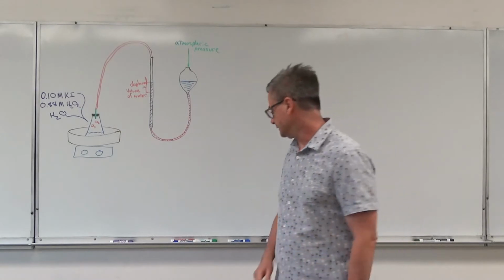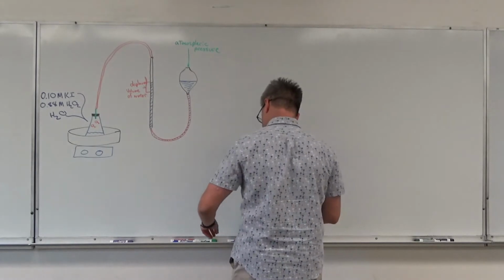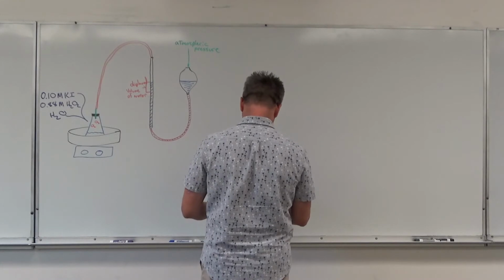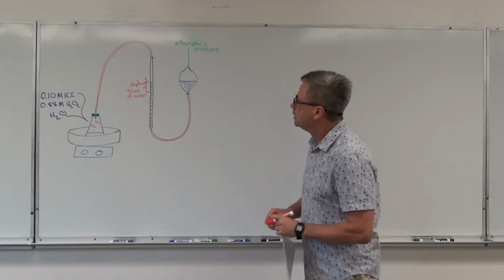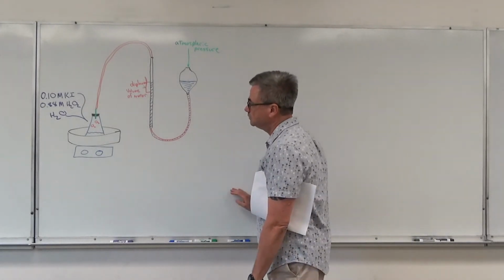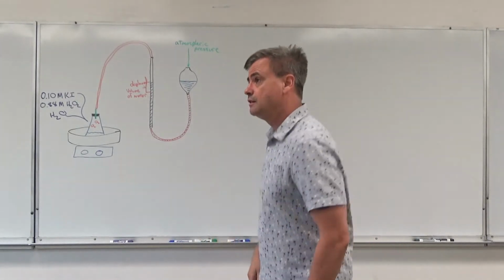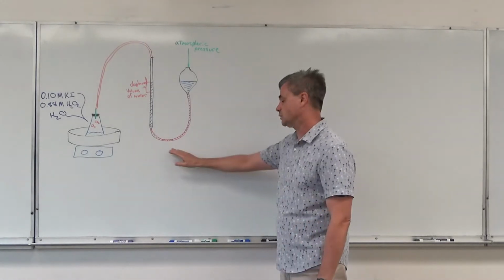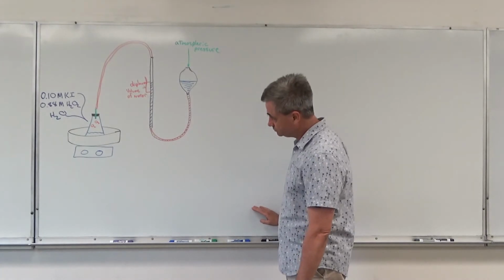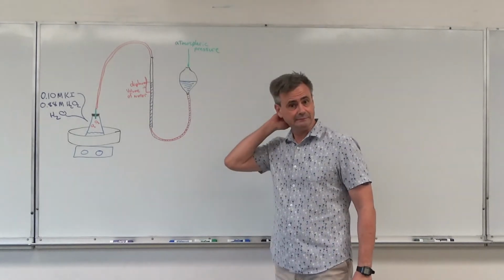If that data ends up being linear, and we know the equation of that line, the rate of reaction, the rate of change in hydrogen peroxide consumption, which we define as the rate of our reaction, is going to be the slope of that line.